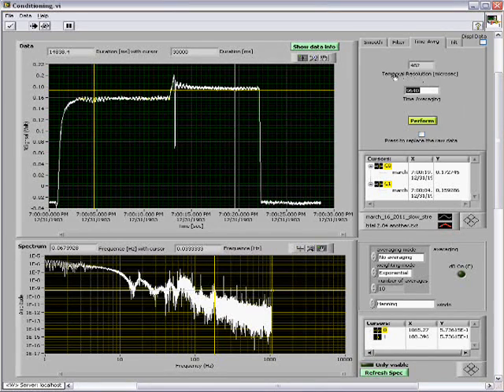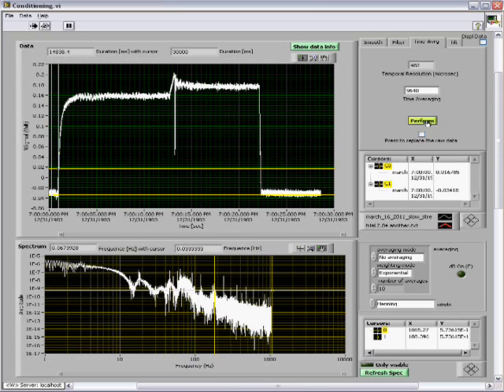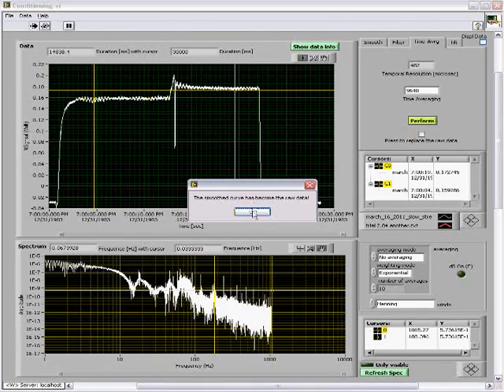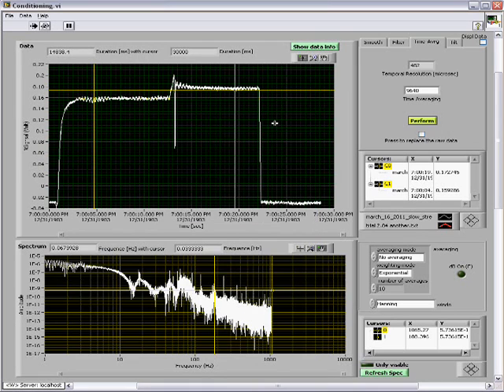So for 482 microseconds of data acquisition, the program makes the average and replaces all the points in between this time interval with one single point. So that's why you're losing temporal resolution. So this is the time average data, and I can display the raw data again and perform it again. And if I press this button again, this time averaged data replaces the raw data.